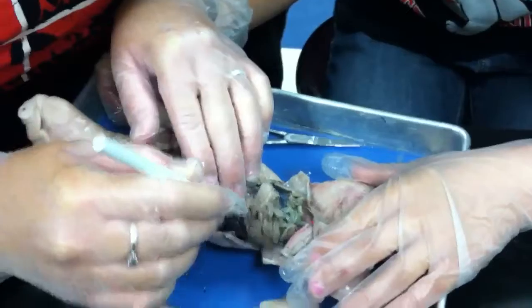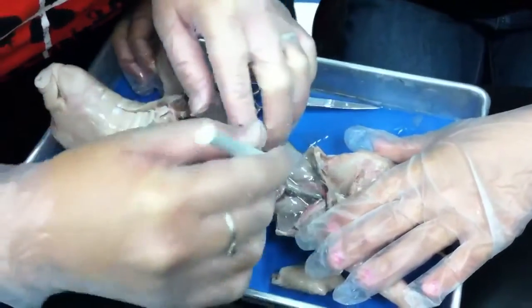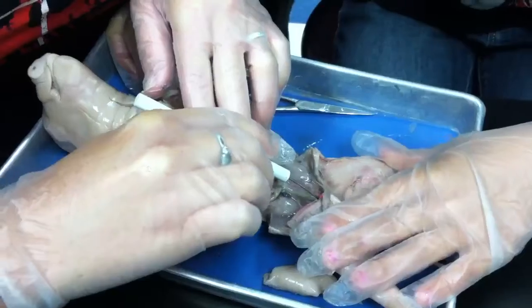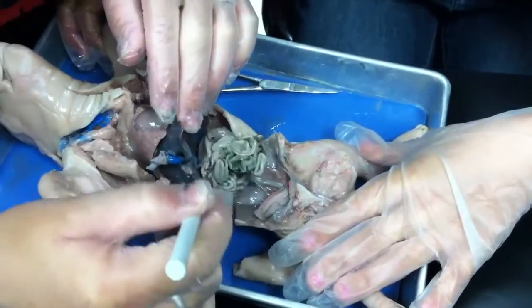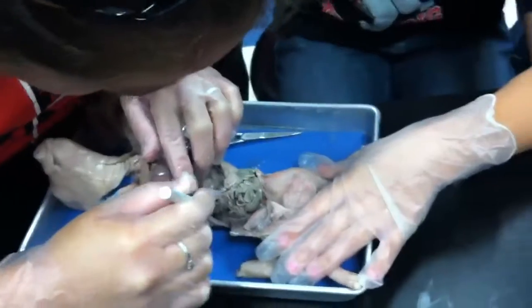Now, what on earth is all this crazy stuff? Small and large intestine. Small intestine, and when we lift it up, we're going to see the large intestine, we can kind of follow it. This is the anus, right? If we follow it down, the large intestine is going to start. I wonder why the small intestine is so long? Yes. So the pigs get big.